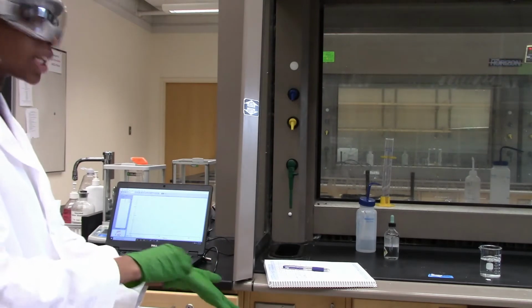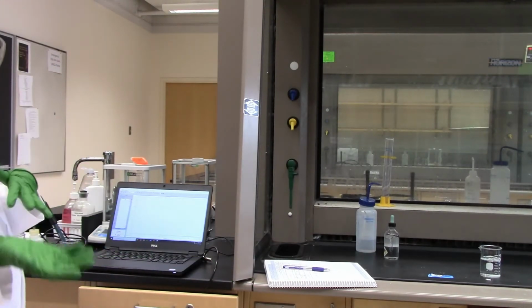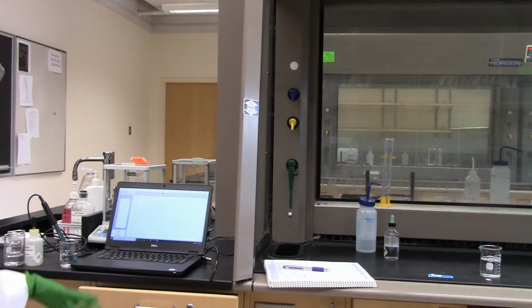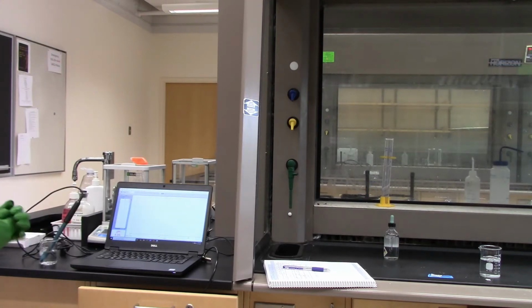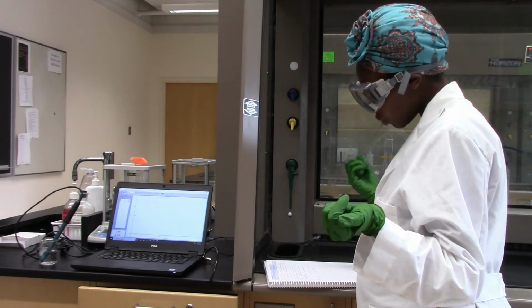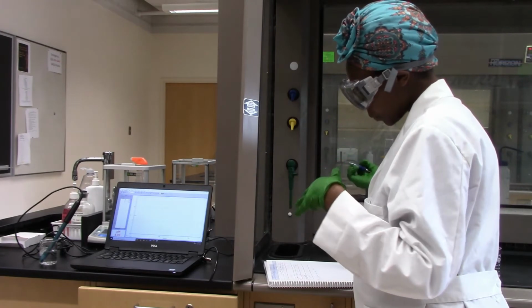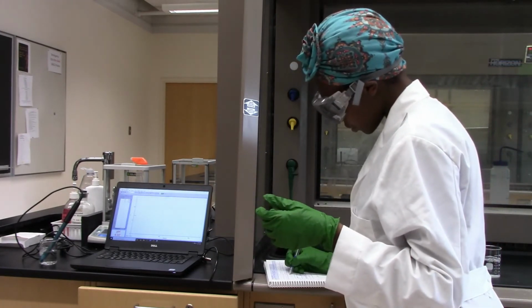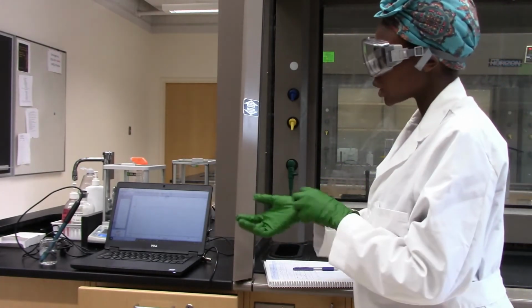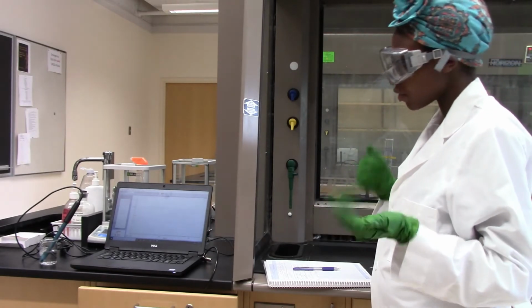So sodium hydroxide is a base. I basically expect that the pH reading will be above 7, because it's basic, it has a high concentration of the hydroxide anions. Okay, so our starting pH for pure water after the HCl part is 4.03. It doesn't make a lot of sense to think that water is a little bit acidic, but just think about it as the starting point, the 4.03.